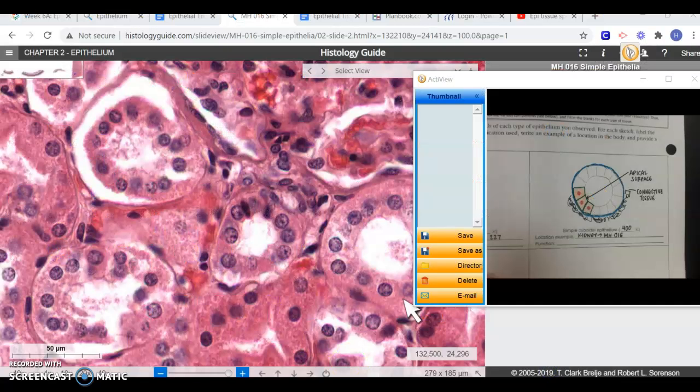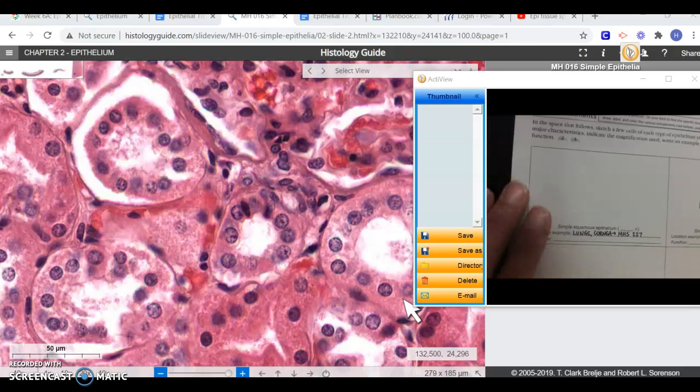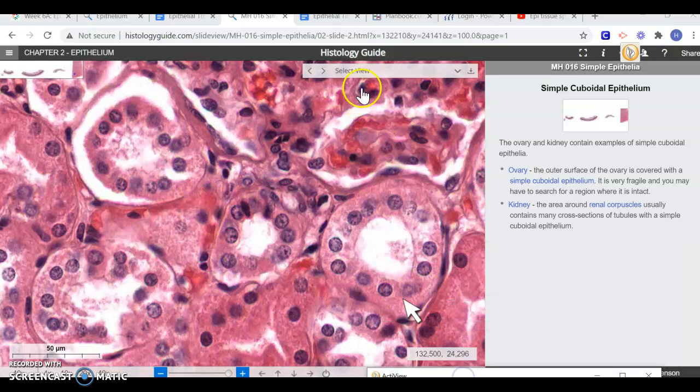Feel free to reach out and speak up and ask if you have any questions. Use those pictures in the textbook as a guide for what you need to see. Like we said, they're not always going to be just a straight flat line of cells, but you're going to have to be creative. When you look at cornea, you're actually going to see that it's turned sideways. And so it's awesome, but read through the particulars that it gives on the side with the lab. Don't be afraid to use all those other components that it has, selecting the different views of the specific things you want to see and zooming in as much as you can to see all those particulars.